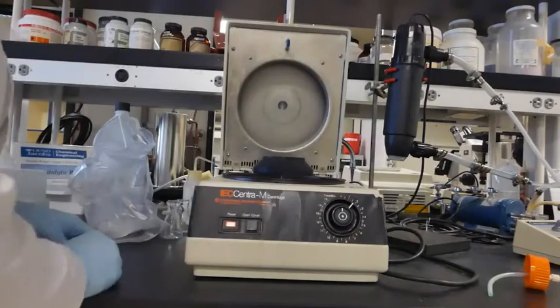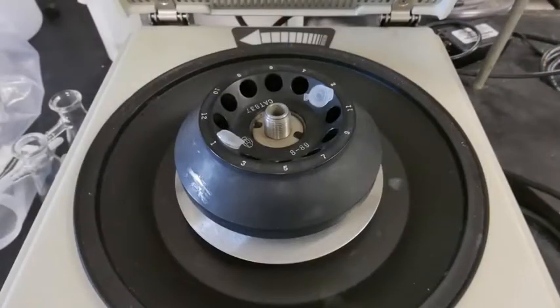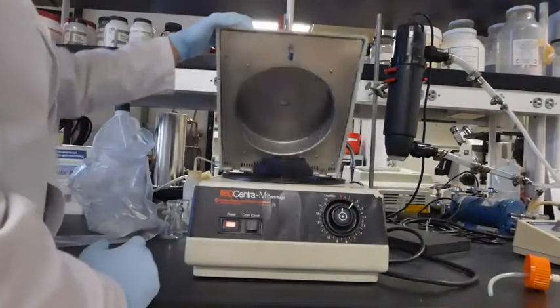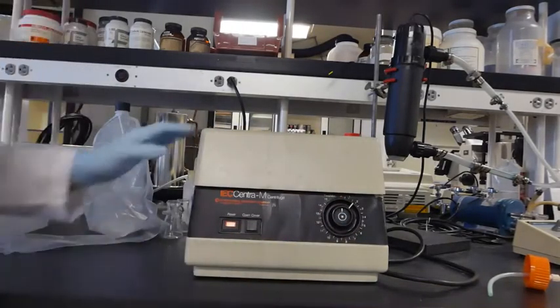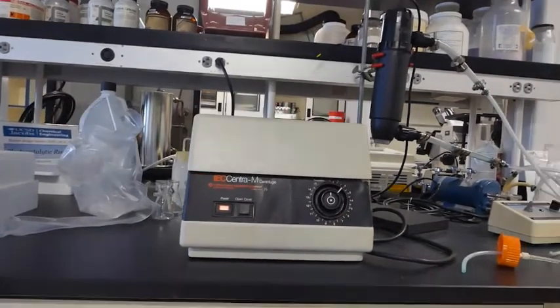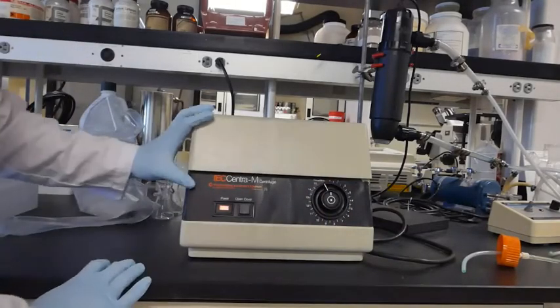Turn on the power, open the cover, and place your samples. Make sure to balance the centrifuge by placing the tubes on opposite ends. Close the cover, turn the dial clockwise, and press the center dial button to start the centrifuge. The timer will not work on this particular centrifuge, so remember to keep track of time for about 1-2 minutes. After time is up, turn the dial all the way counter-clockwise and wait for the cover to open.